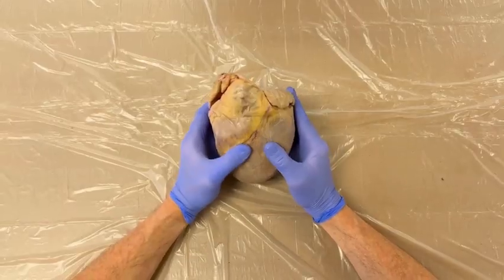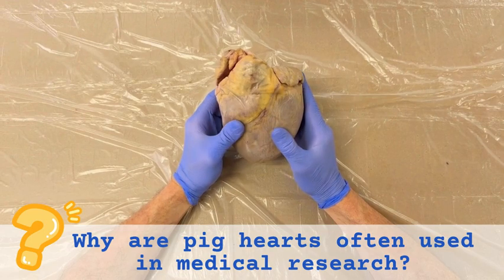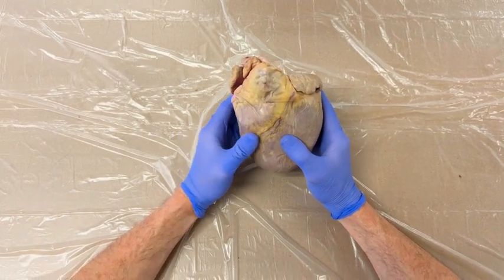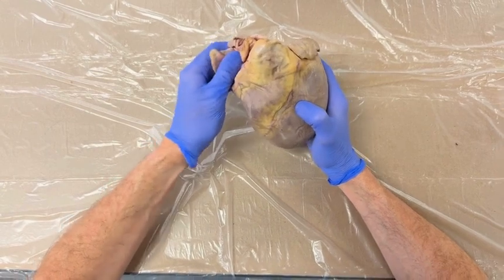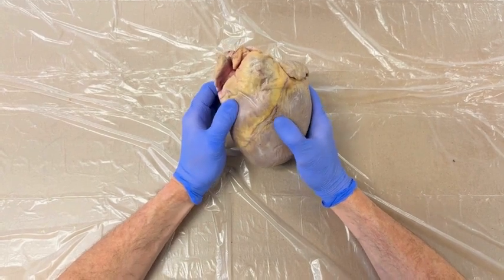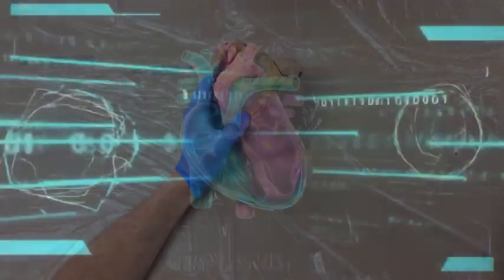We are now going to start with the pig heart. The pig heart is fascinating because it's very close in size and structure to a human heart, just a little bit bigger. This similarity is one of the reasons scientists study pig hearts for medical research and even for possible organ transplants. And this is related to stuff you have previously learned about solving medical problems using technology and science.